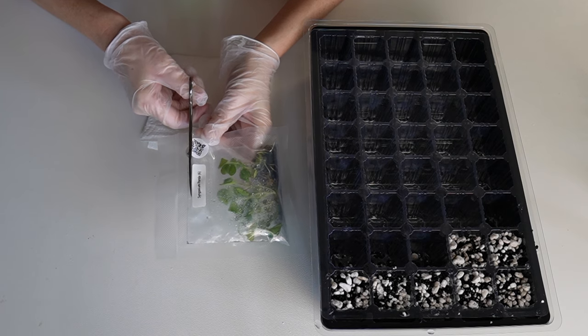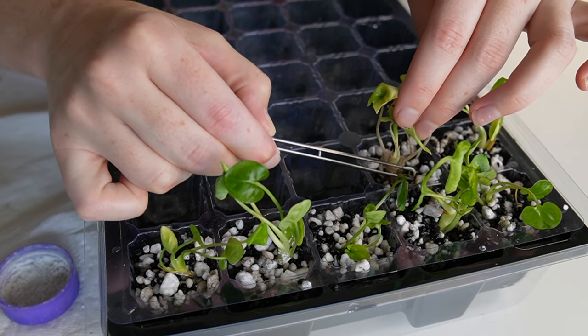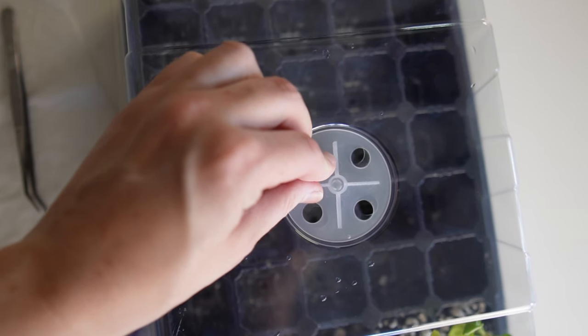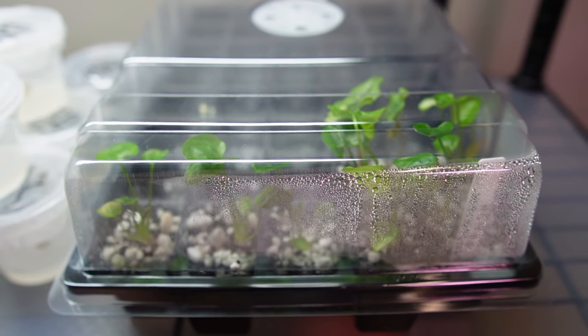This video is going to be split into three parts. In part one, I'll do a demo showing how to take plants out of tissue culture. In part two, I'll summarize how to care for your freshly acclimated plants for the first eight weeks of their lives. And in part three, I'll share some tips that have helped me in the past.